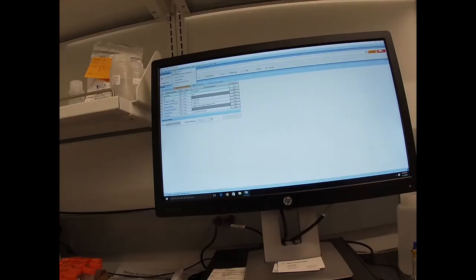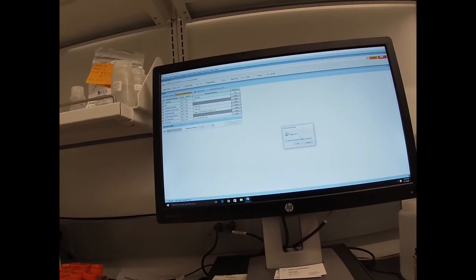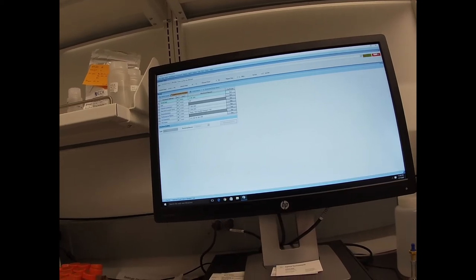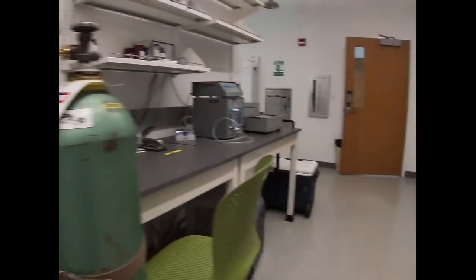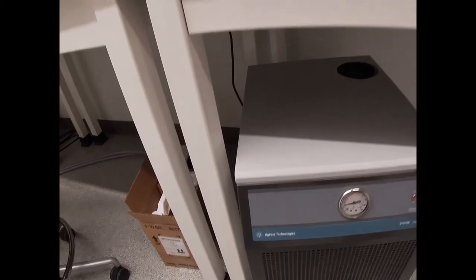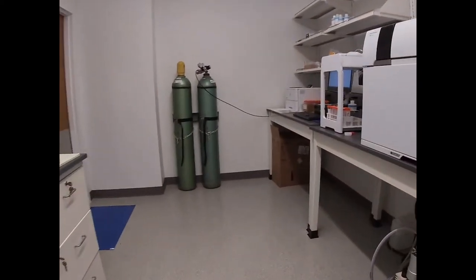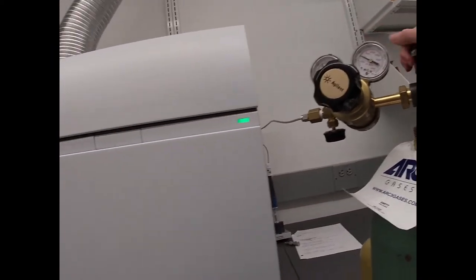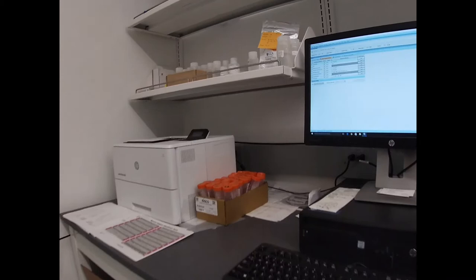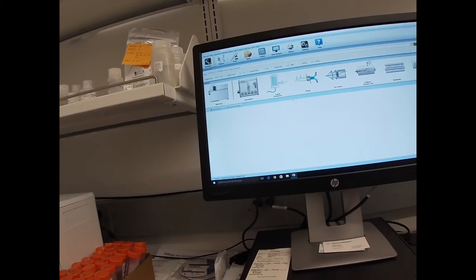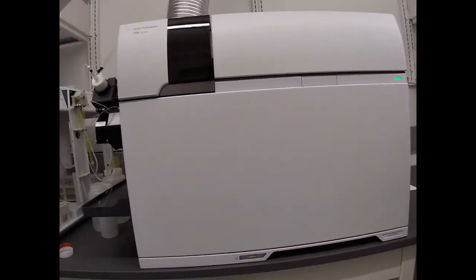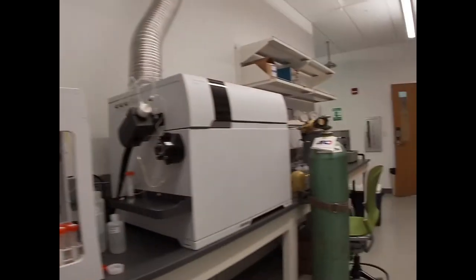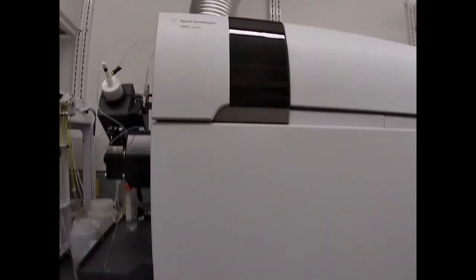So I'm going to go up here to plasma. Plasma on. Oh, I need to turn my chiller on to ignite the plasma. So now it gets really noisy in here. And we want to turn on our helium gas as well. So it takes a while to initiate the plasma. It's about to ignite. Let's go up here and see what we can see. There we go.